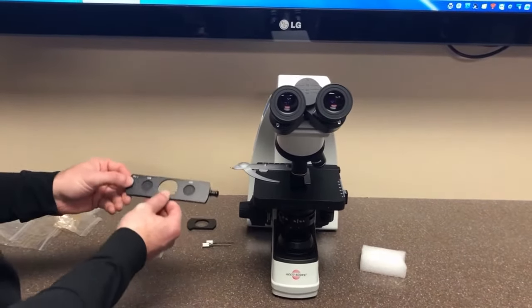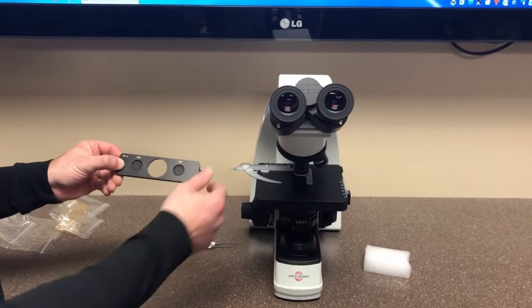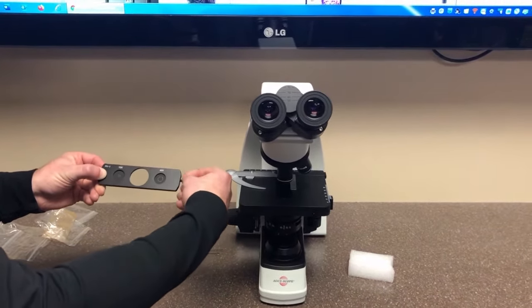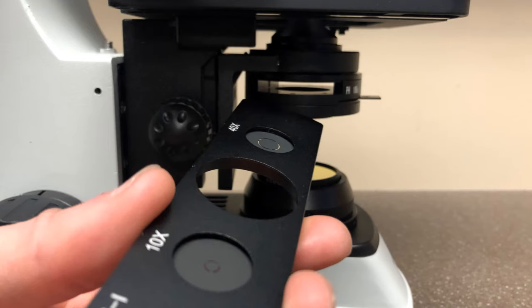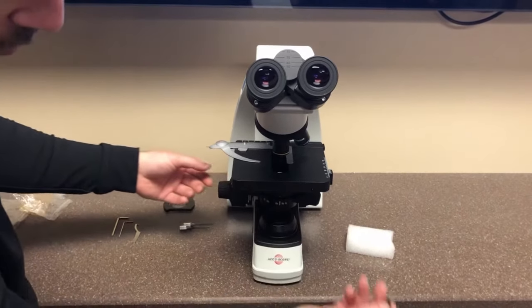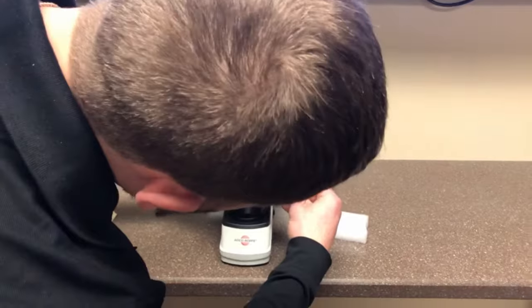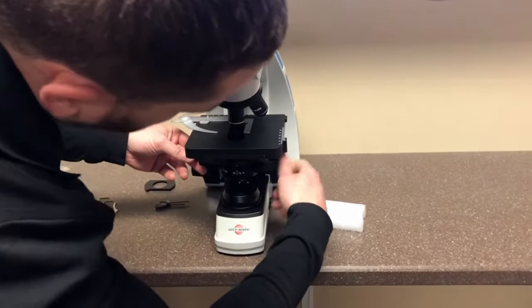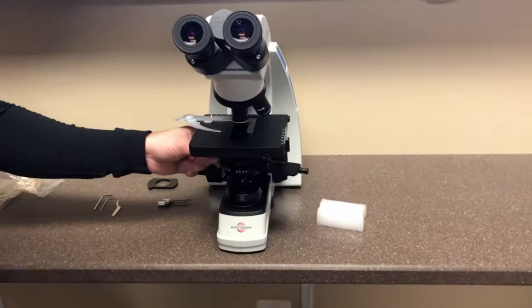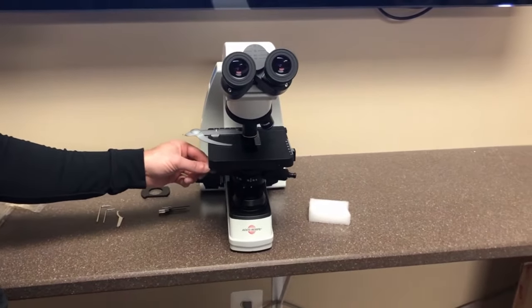The phase slider allows you phase contrast on the 10x and 40x objective. Unscrew the thumb screw on the right hand side and push it through the slot that you just removed the plastic component from. Once you have it secured, tighten the thumb screw back on, and now you can slide the slider for phase on the 10x and 40x objective.